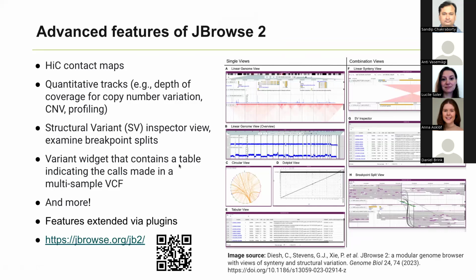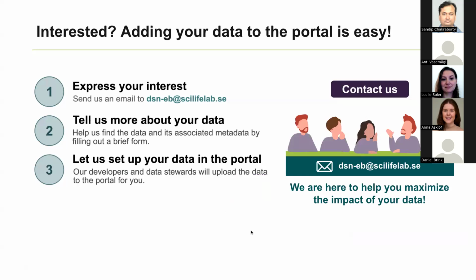Also, there are additional tools and functionalities provided by the community or the developers of the genome browser. And I hope that you're interested in contributing and putting your data in our genome portal. So here's just a little reminder that it's as difficult as just sending us an email, and we start the conversation. Essentially, we're here to help.